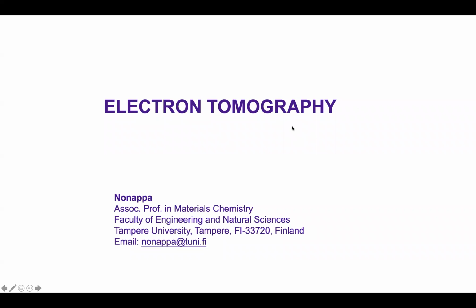Welcome to the second part of the lecture. In this part, we will look into electron tomography.